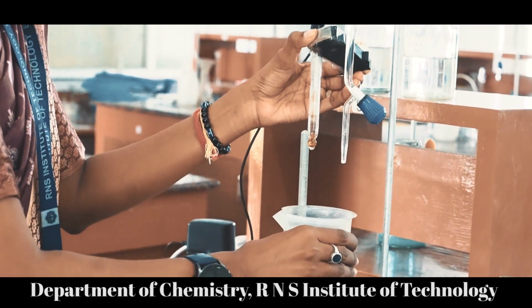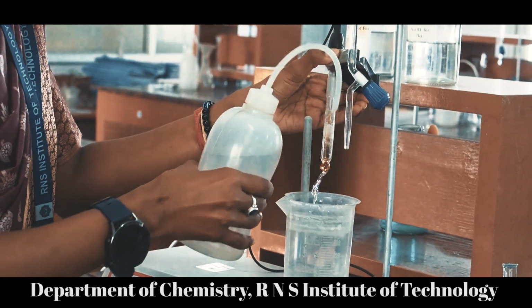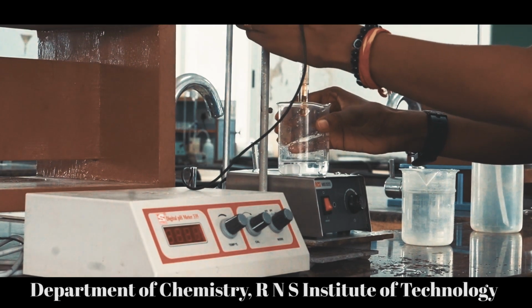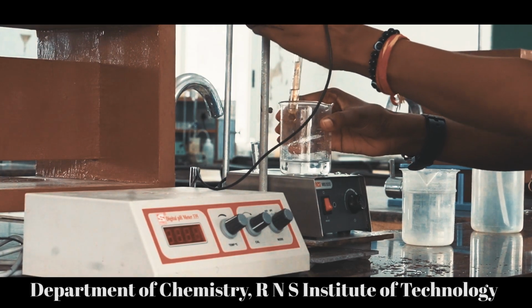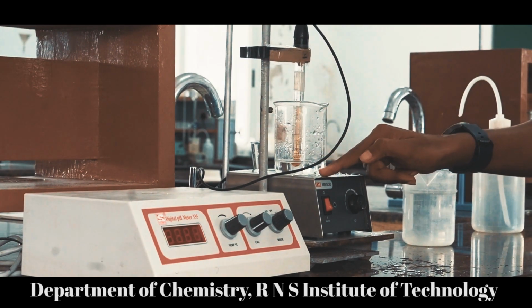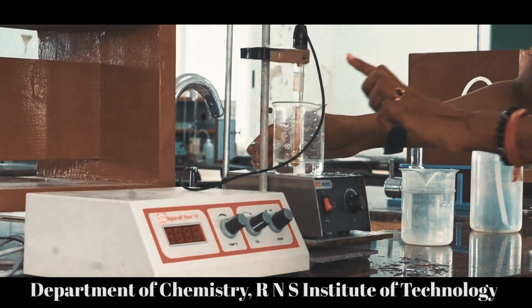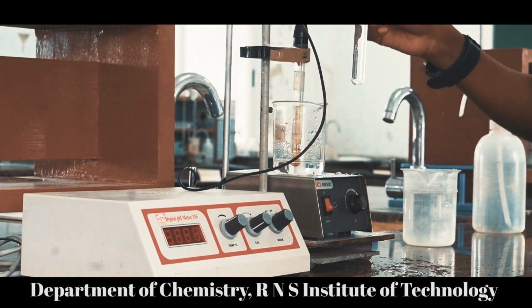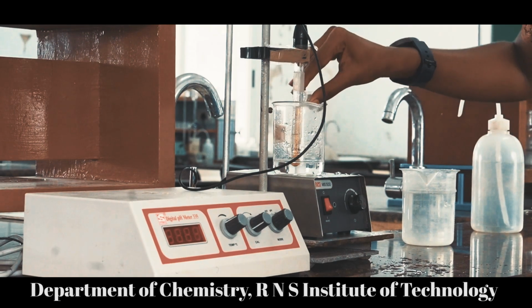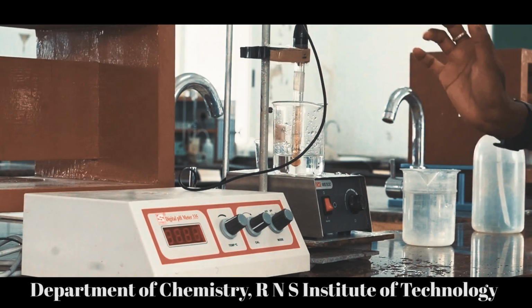Now, let us wash this electrode into the same beaker. Like this. And this beaker is replaced with our beaker containing weak acid. Be careful while replacing it. If that bulb touches the bottom of the beaker, it might break. To this weak acid, I am going to add 1 test tube full of demineralized water to create an aqueous medium. And now let us switch on the instrument.